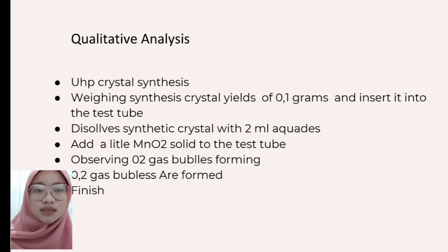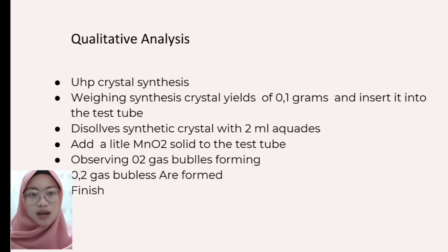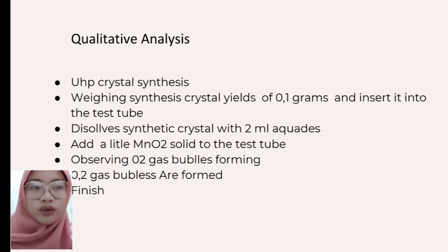Weigh 0.1 grams of the synthesized crystal and insert it into a test tube. Dissolve the synthesized crystal with 2 ml of aqueous and add a little solid MnO2 to the test tube. Observe the O2 gas bubbles forming, and the process is finished.